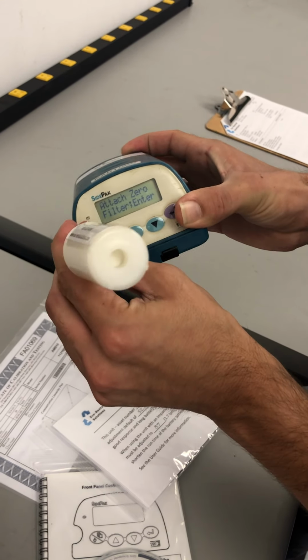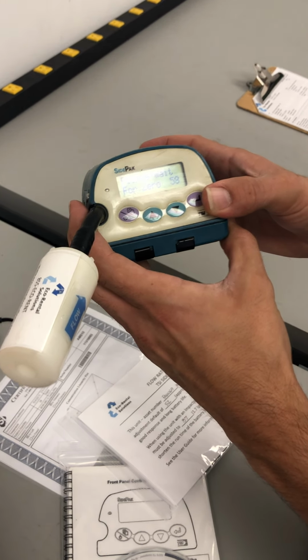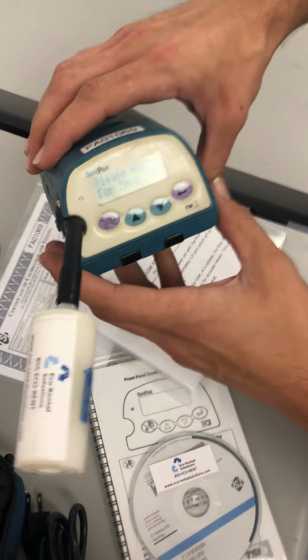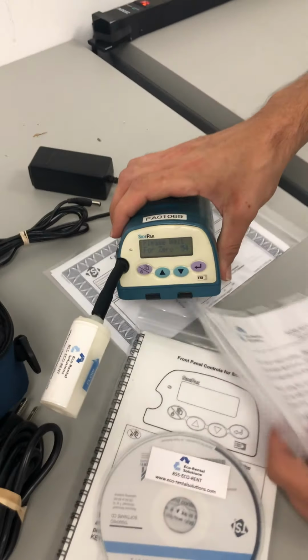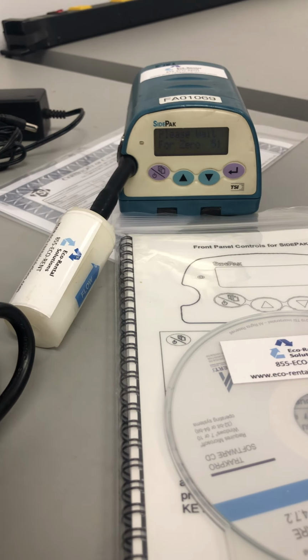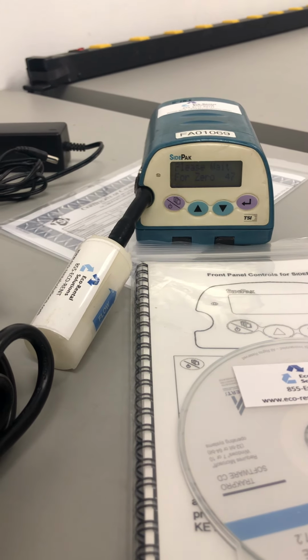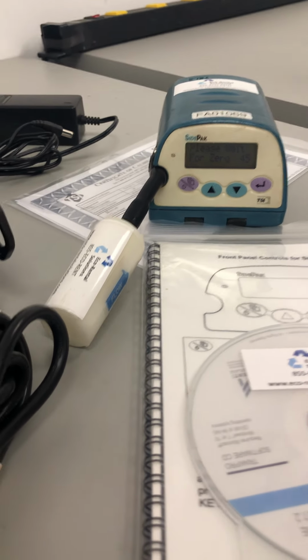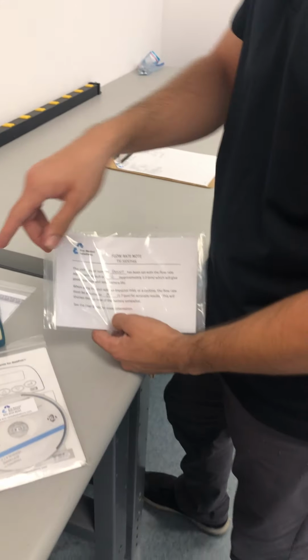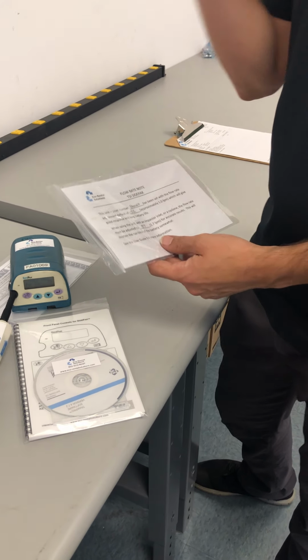So we got the zero filter there on the right. And it's going to go through a 60-second countdown. While we're doing that, I'll start introducing you to this thing, which will go out next. So the way this one is supposed to work, if you're using the total impactor as opposed to one of these PM 2.5, PM 10, it says to set it at 1 liter per minute.